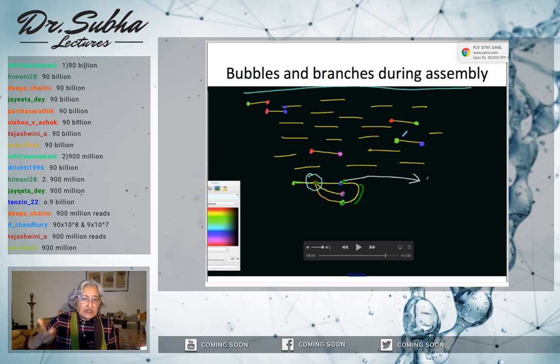Okay, so more or less you got it empirically. By trial and error, by empirically doing this, people know that somewhere close to 31-mer, and of course, longer is better. But what is the shortest that can be unique? Comes to 30, 31, 32, 33. That's where it comes to. So that's a critical overlap that we're going to use. That is also called a K-mer.